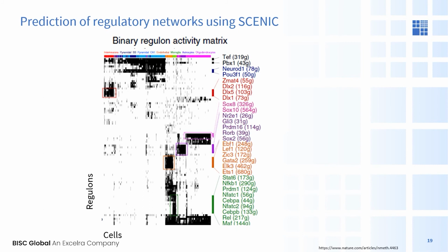So these networks all group genes into co-regulated modules, which can show specific activity in a given condition, treatment versus control across differentiation stages, or in the case of this example, by cell type. So highly active modules for the SCENIC package are shown in black, and it is clear that this technique is a powerful hypothesis generating tool for driving networks of a given cell type or process.